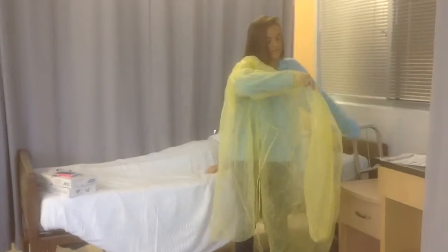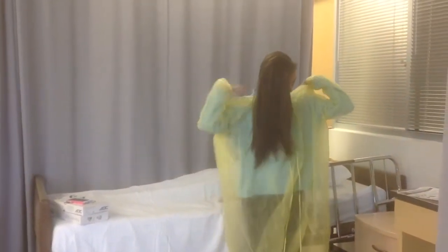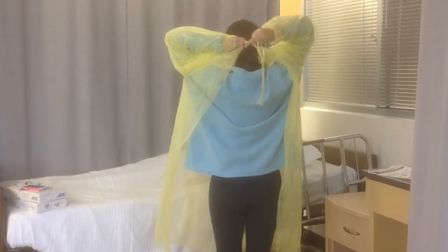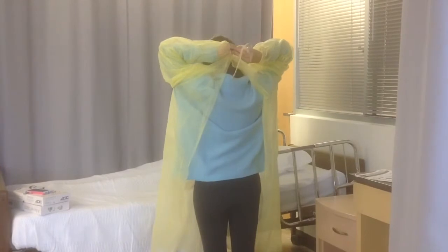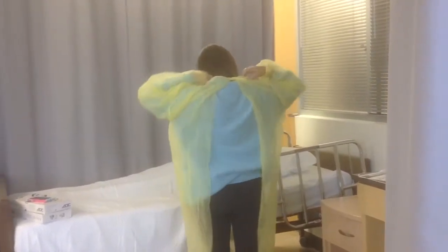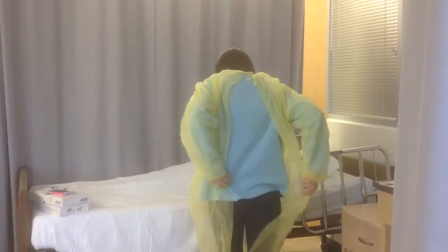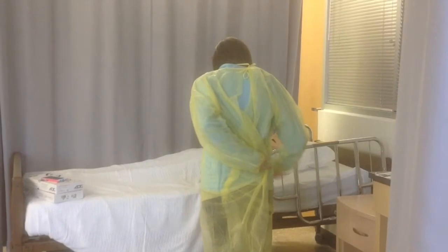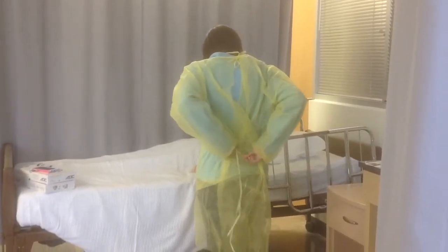Put your arms through and tie it at the top. Get both of the ties and tie it into a bow at the top. Then take the bottom straps and make sure to crisscross them in the back so that your full back is covered. Take the ties and tie them into a bow as well.